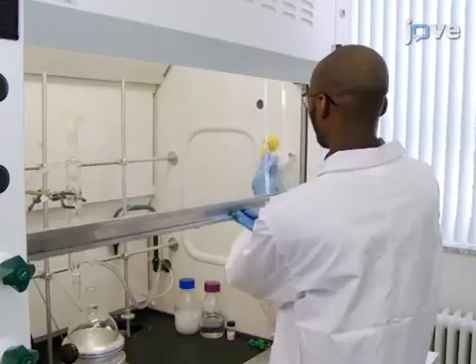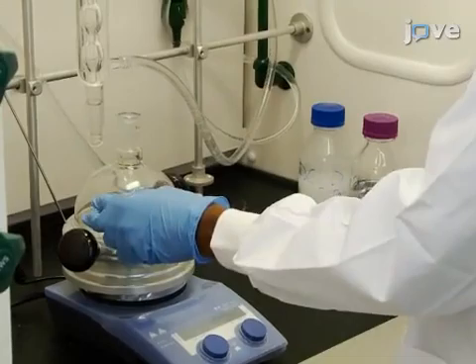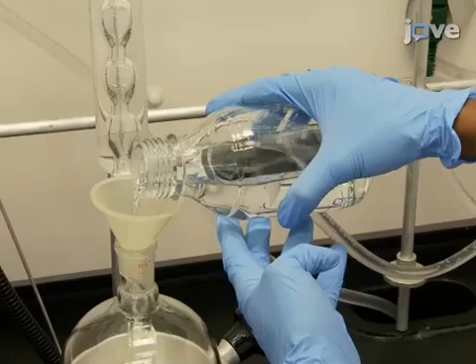Demonstrating part of the procedure will be Mubarak Compaore, a graduate student in the Claverie Laboratory. To begin this procedure, set up a 1-liter round bottom flask with a condenser and stir bar.